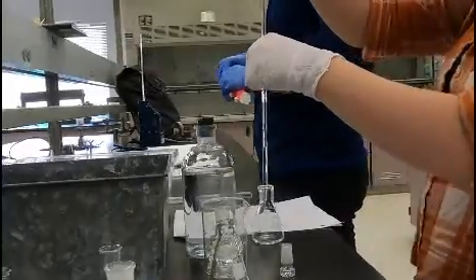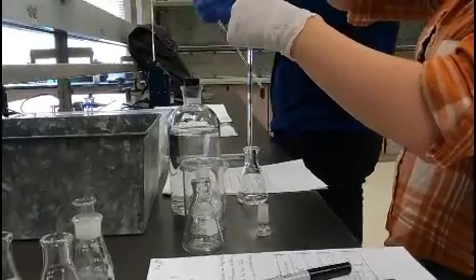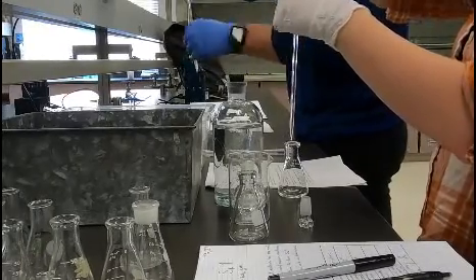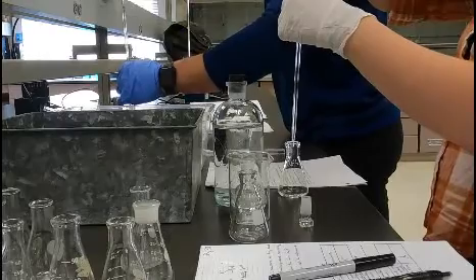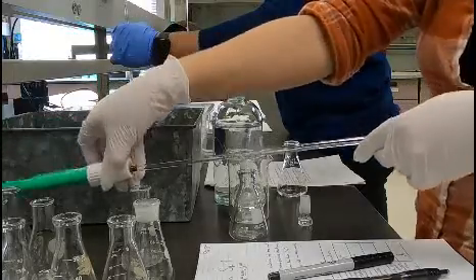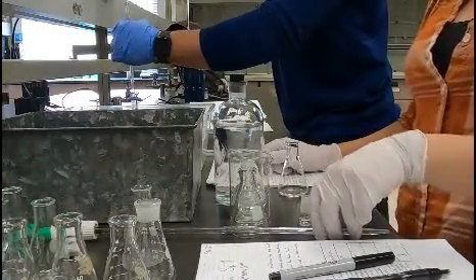Alright, so you pipette in the first one. This is the first set — the room temperature set. Just so my viewers know, you guys are doing the first set of the SN1 reaction. You're using three mls of the 2-chloro-2-methylpropane.